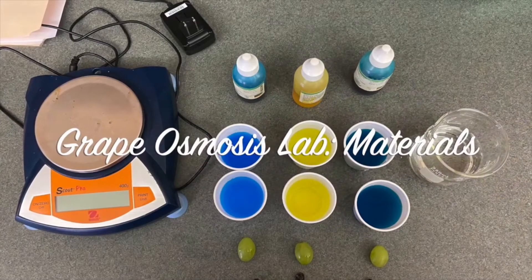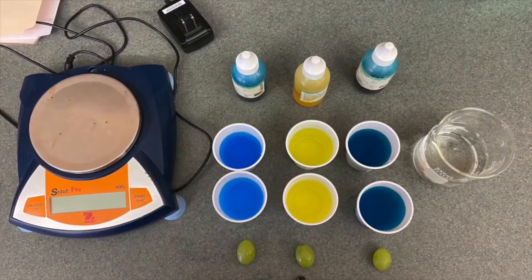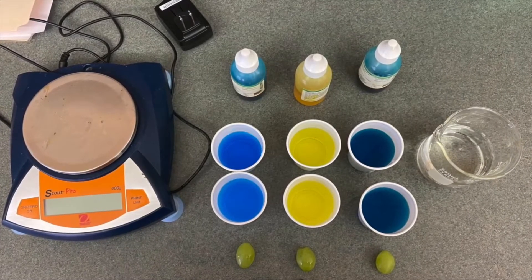Materials for this lab include three unknown solutions, a scale, three grapes, and three raisins.